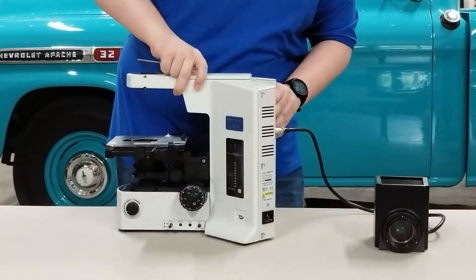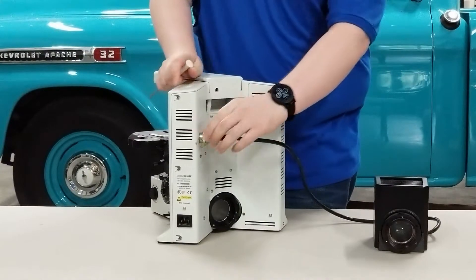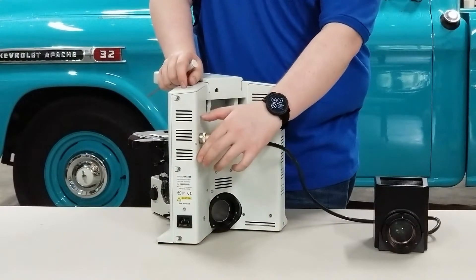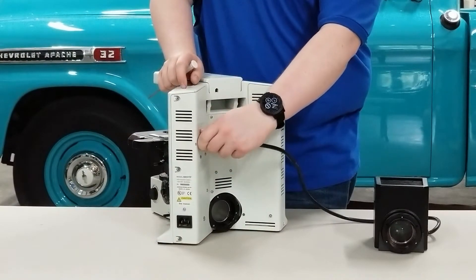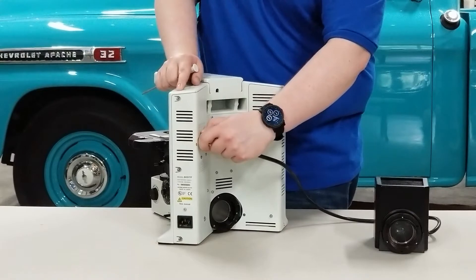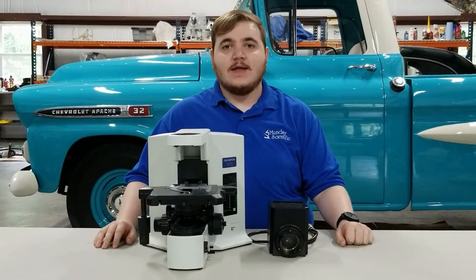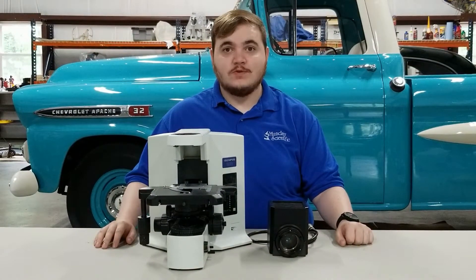Then you'll see there is a plug on the back with a collar — it's spring-loaded, so just turn it till it stops and then pull straight out to disconnect. And that was how to remove the lamp house on a BX-51 microscope.